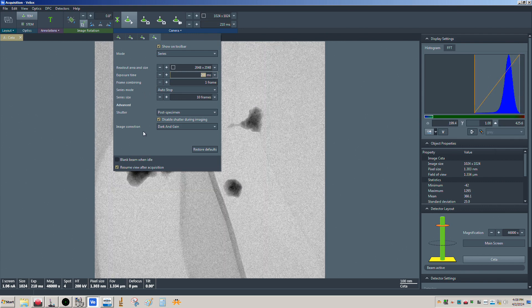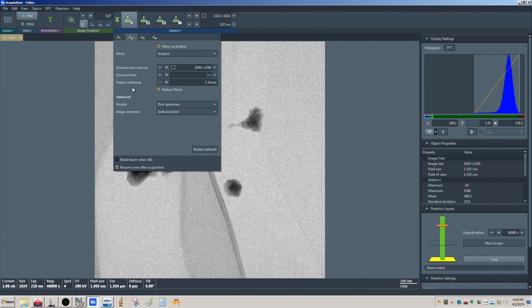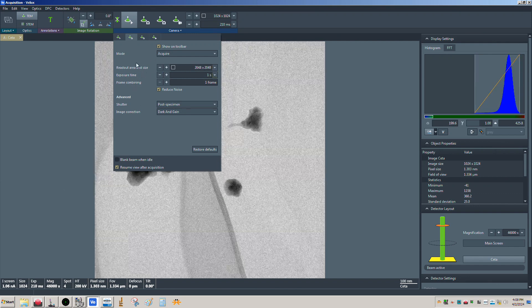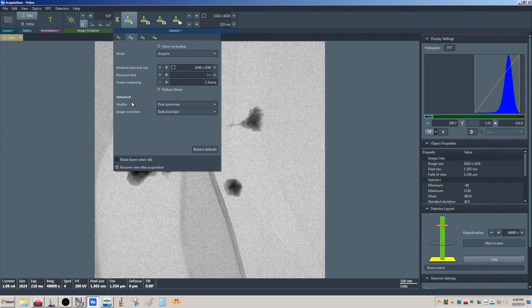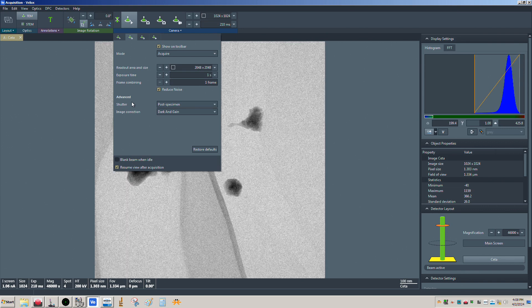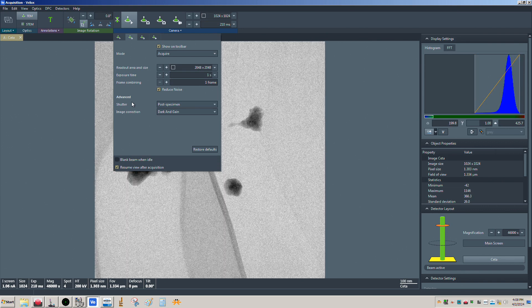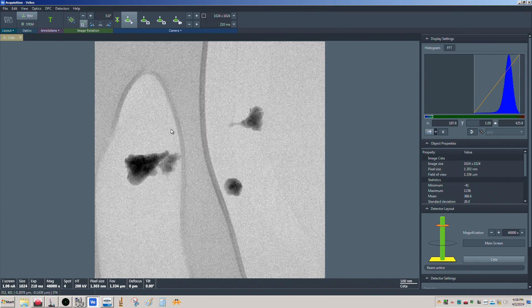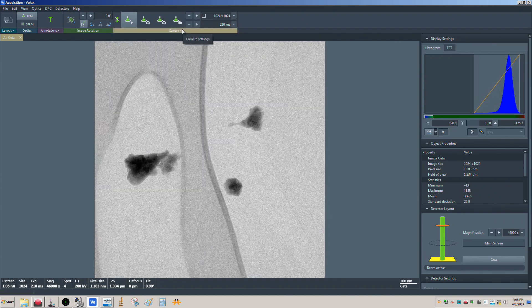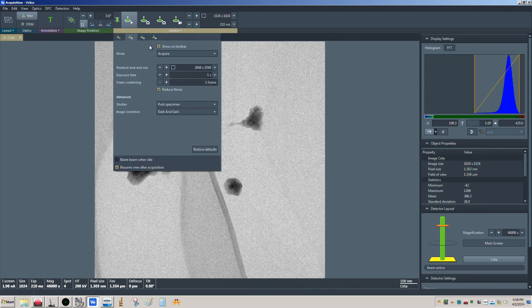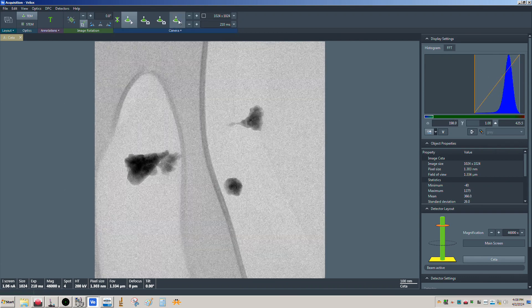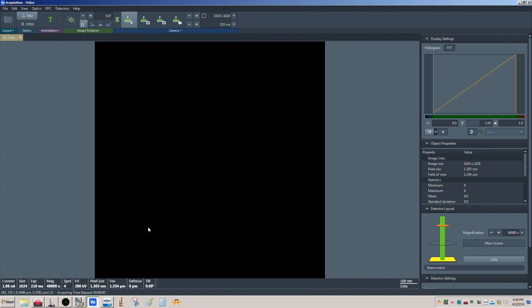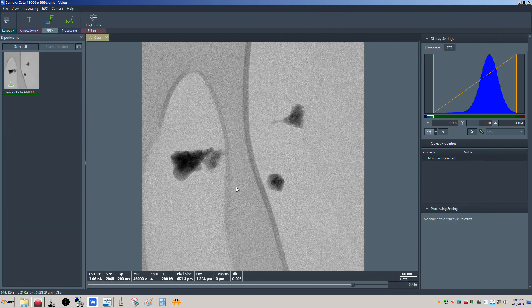The key is to keep the time per frame short, because if we keep this short then the effect of instability is going to be negligible. Whereas if we're doing one frame for one second, the effect of that instability becomes more obvious — and depending on the magnification you may not even see it. Right now at 200 milliseconds we have decent signal-to-noise, so when we sum the frames it should work. We just hit Acquire Series and it will take 10 frames each at 200 milliseconds.